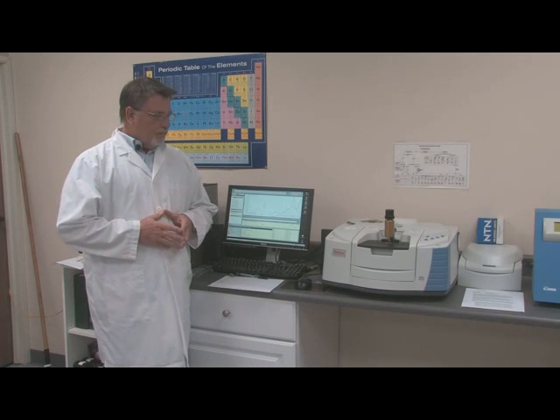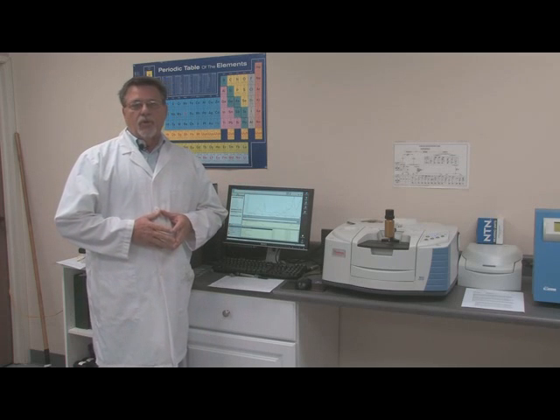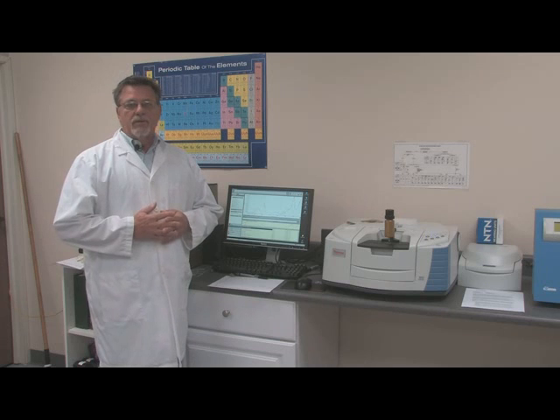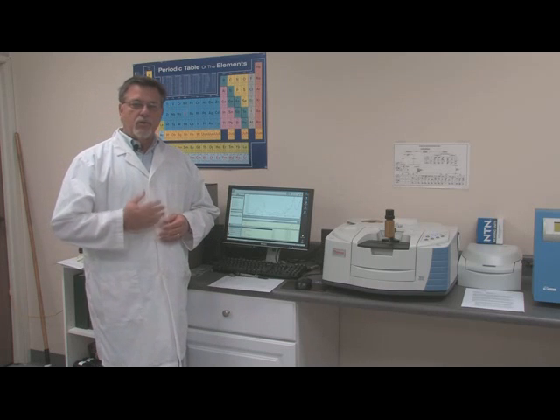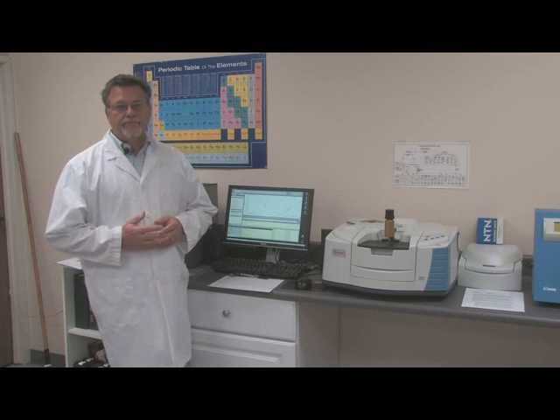There's a lot of things that we can learn looking at it through infrared eyes. Now, along with the FTIR, we can also do other types of analytical tests like TGA and DSC. These are devices that are used to look at the materials in terms of thermal properties and degradation properties. So these are some other things that we can do to assist customers and also assist ourselves in understanding what's going on with a particular material.